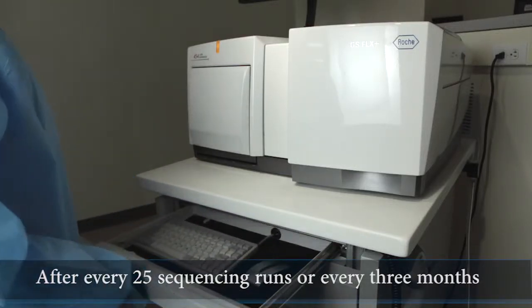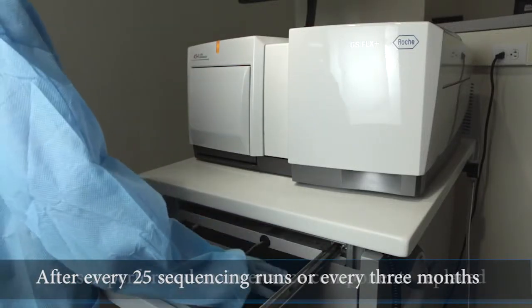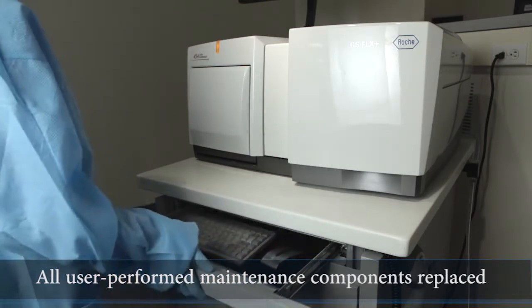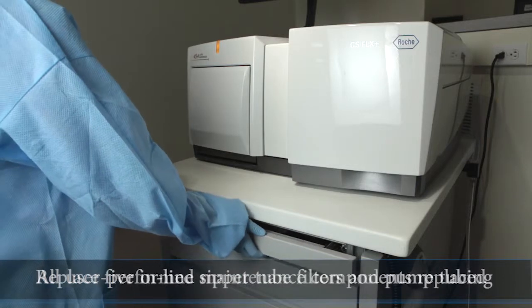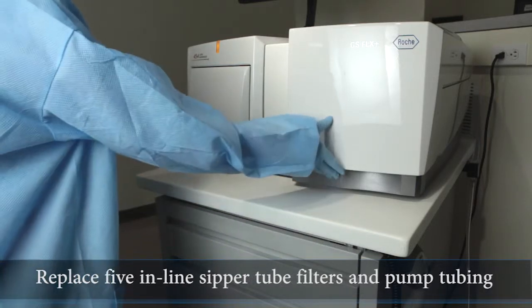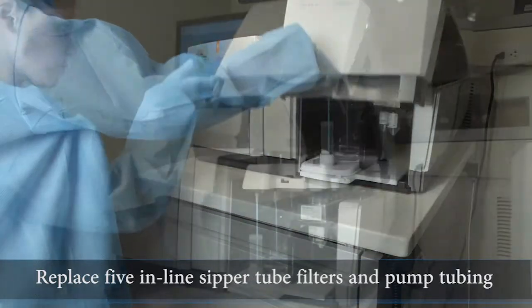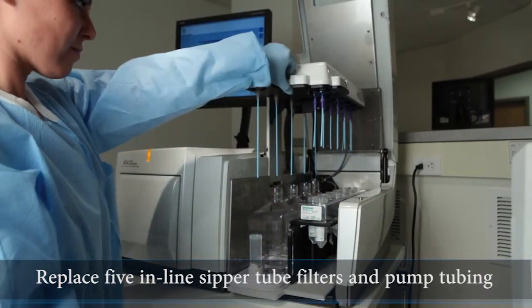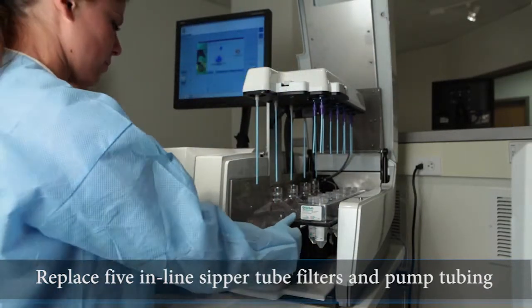After every 25 sequencing runs or every three months, whichever occurs first, all user-performed maintenance components will require replacement. This includes the five inline sipper tube filters on the left-hand side of the sipper manifold and the tubing for the two main pumps located under the pump cover between the camera and the fluidics area of the instrument.